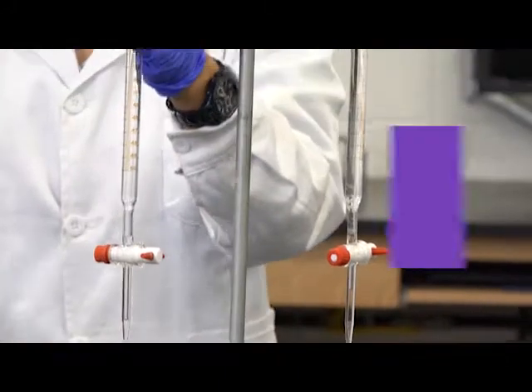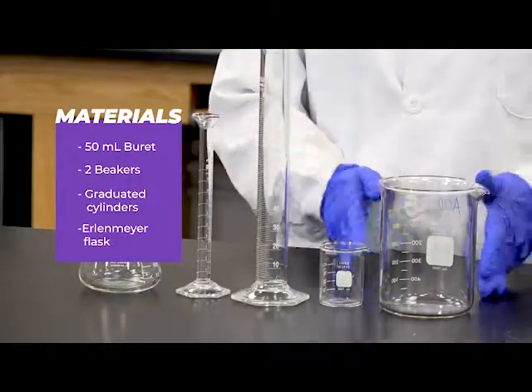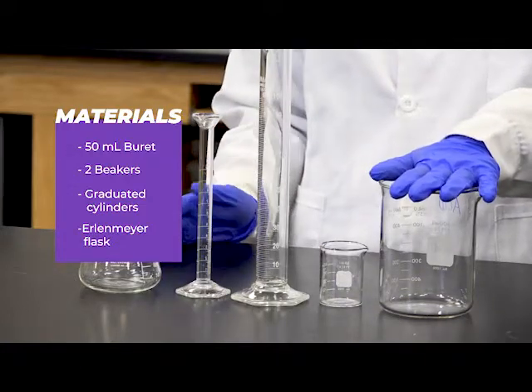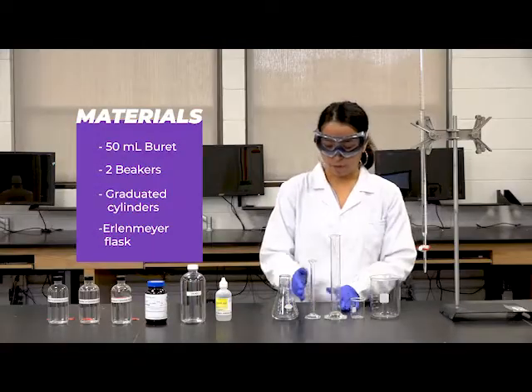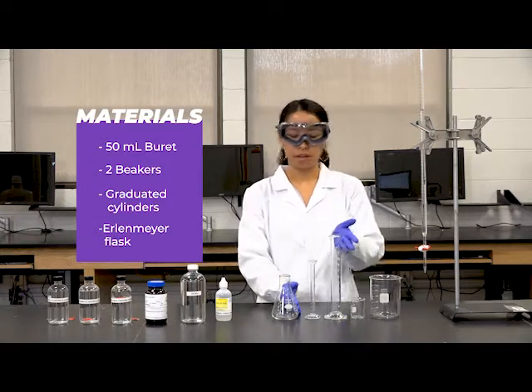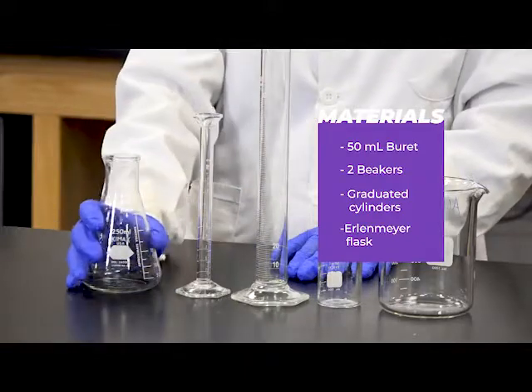For the glassware, we'll be using a 50 ml burette. For the titration, 2 beakers. We're going to be using the big beaker of 500 or 250 ml for the waste of your titration, and small beakers to get the reagents. We're also going to be using graduated cylinders of 10 ml, and an Erlenmeyer flask of 250.